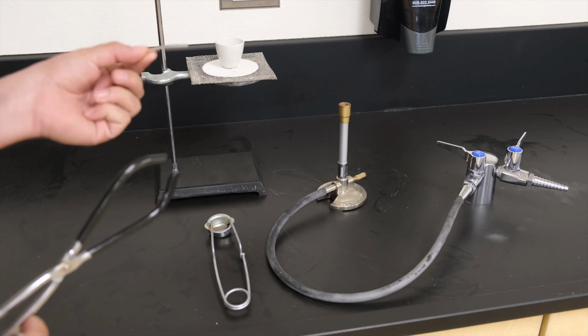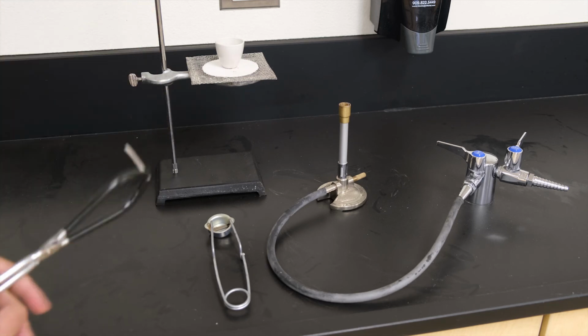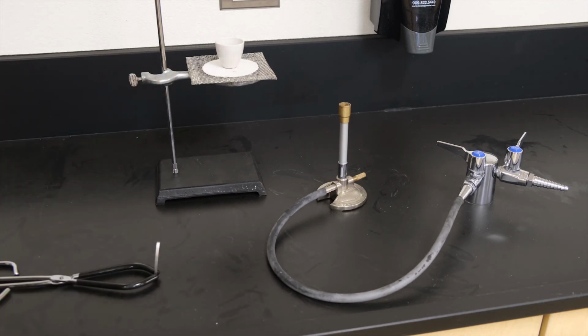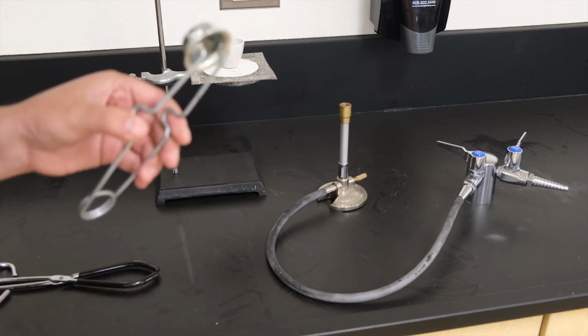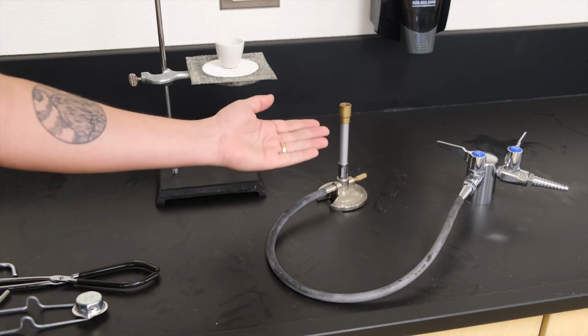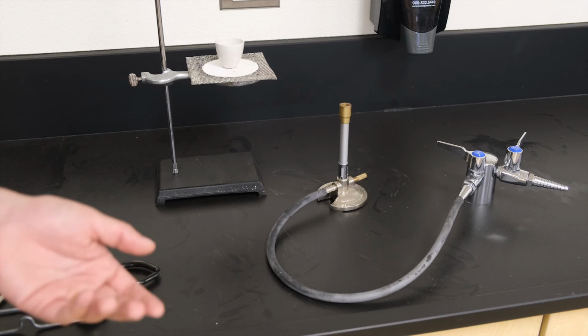We have our magnesium wire. We're going to hold it with these forceps as we burn it over a flame. Speaking of burning over a flame, we're going to need to create a flame. For that, we're going to be using a Bunsen burner, and we're going to have this striker ignite it. Once it's ignited, we'll put our magnesium wire over it. That way it gets its combustion started, at which point we'll put it into the crucible.